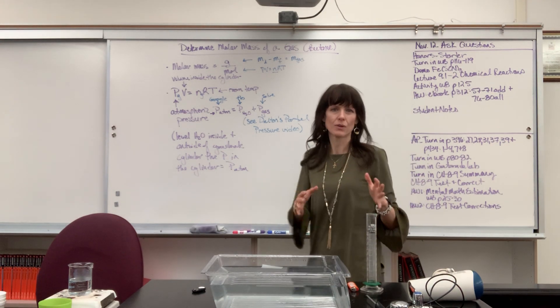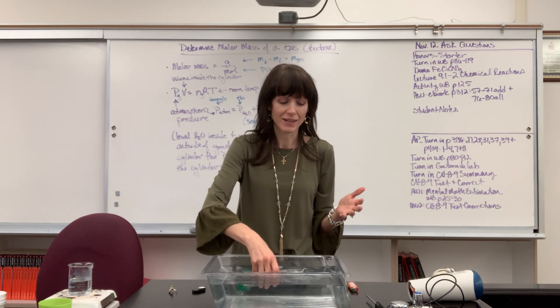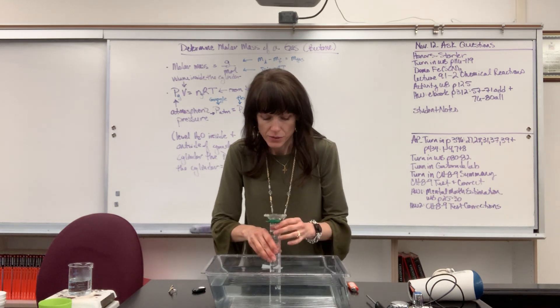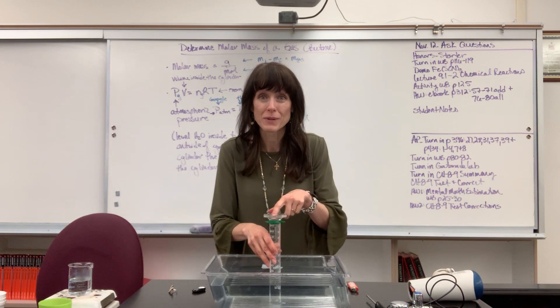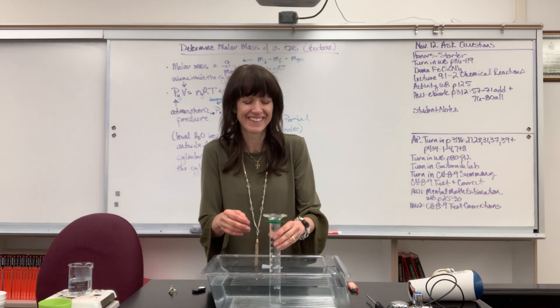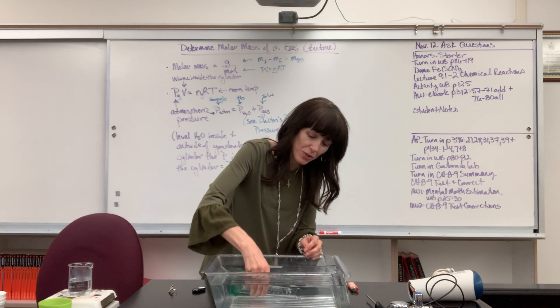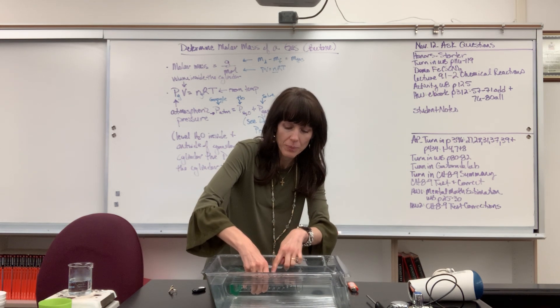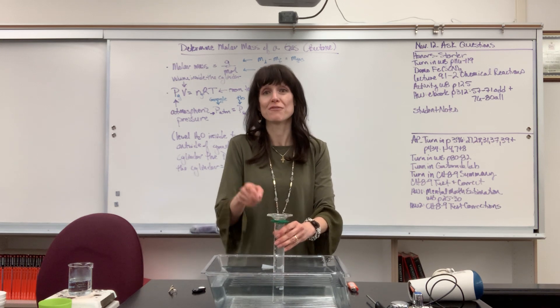Let me show you the logistics of collecting the data — that part is really easy. The hardest part is actually getting all of the air bubbles out. I put the graduated cylinder in here and I want to completely fill it with water, then turn it upside down. You usually get a couple of air bubbles at the top. To get them out, tilt the cylinder and bring the opening up so it's elevated, and just let the bubbles slowly go putt, putt, putt — and finally they come out the top. When you go like this, you should see no air bubbles; it should be 100% filled with water.